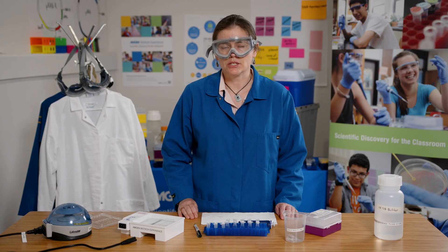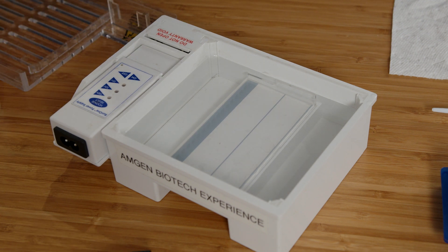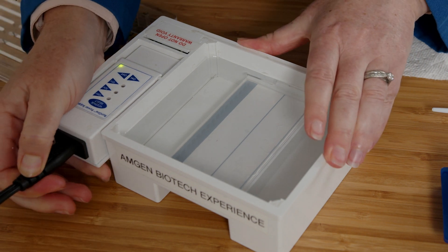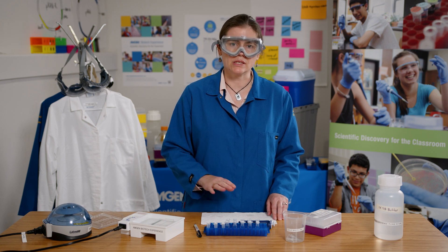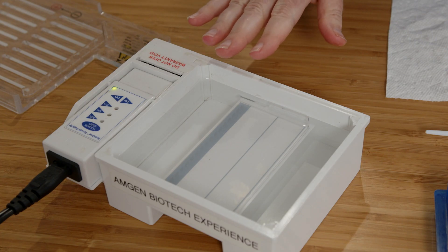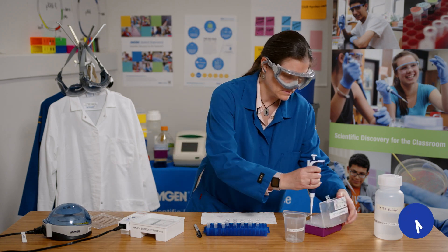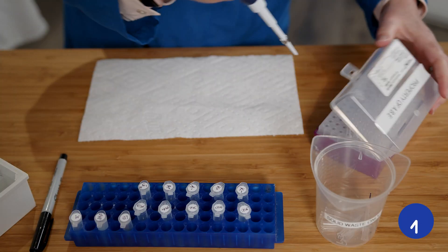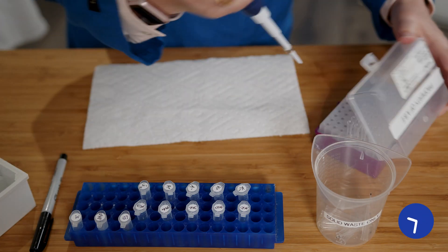Now I'm ready to load the samples into the gel. Notice that the electrophoresis chamber is already set up — we have a gel and the buffer is already in the gel box, loaded just above the gel. It's close enough that we can plug in the gel box. Similar to lab 1.2, I'm going to load 10 microliters of each sample into its own well in the gel, this time including the DNA ladder. Remember when you load a gel, you need to keep your arms steady, insert the tip under the buffer but just above the well, and only press down on the plunger to the first stop.